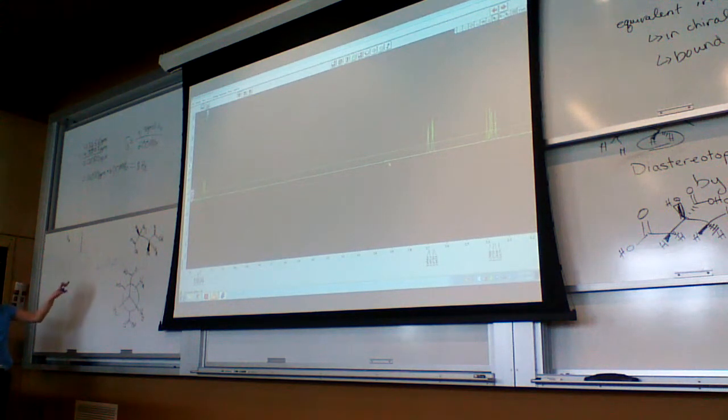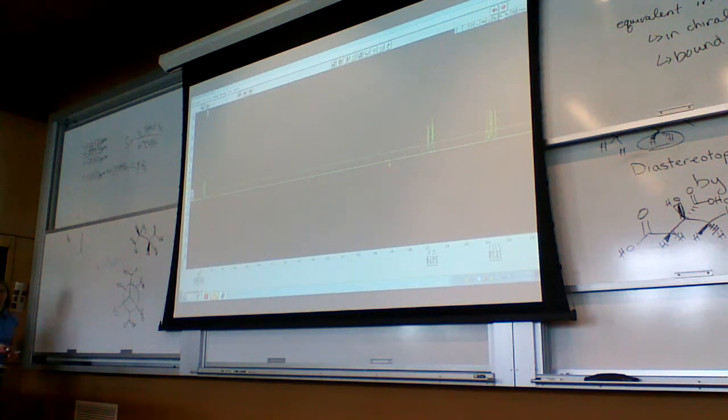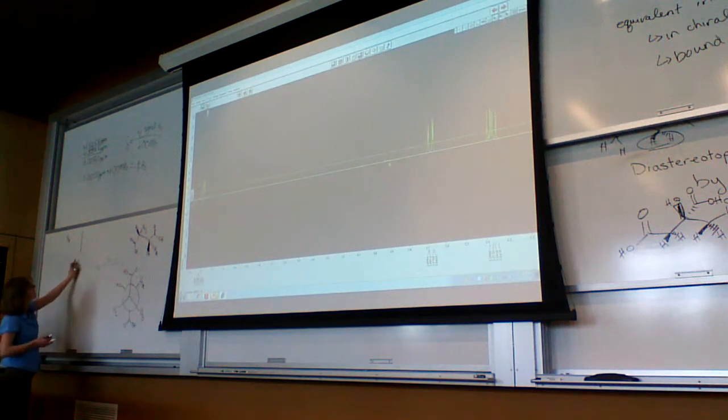So JAC has split it once by 10.25. JAB then is, we're going to make that smaller. So if that on your grid was, I would make it maybe 5 squares across on either side.